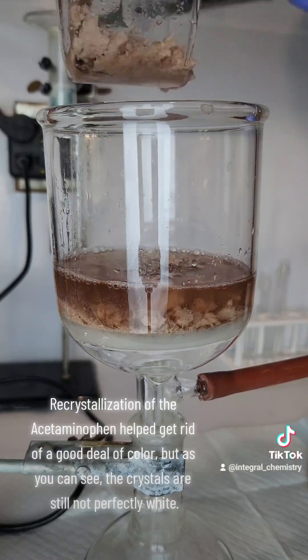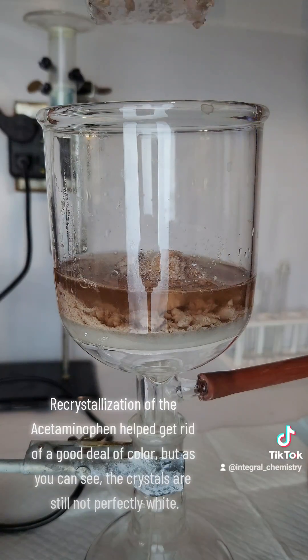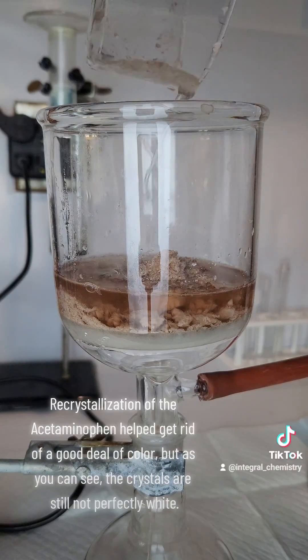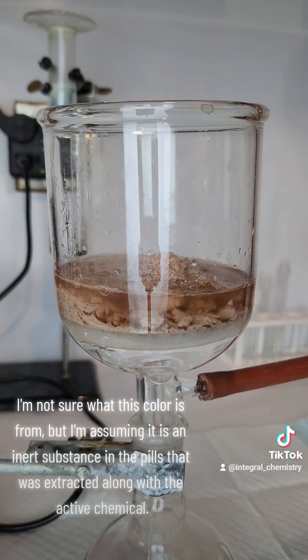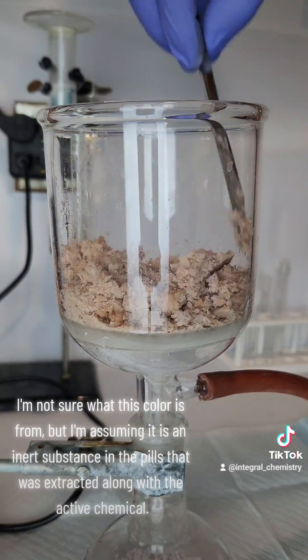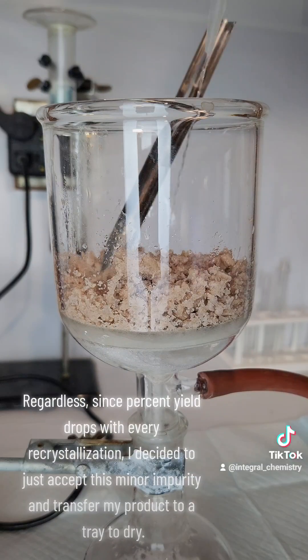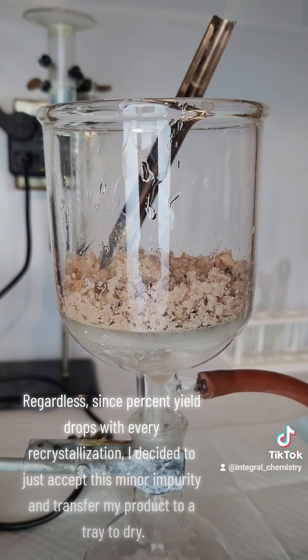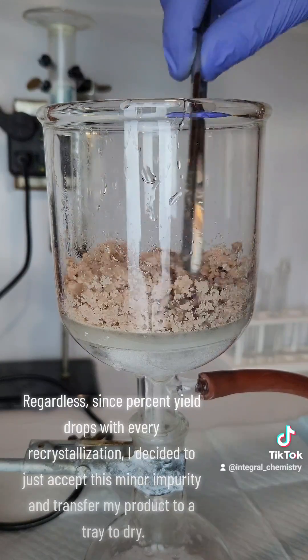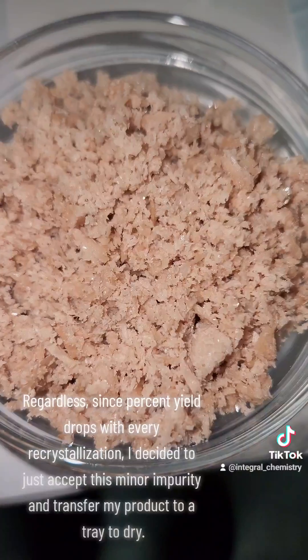Recrystallization of the acetaminophen helped get rid of a good deal of color, but as you can see, the crystals are still not perfectly white. I'm not sure what this color is from, but I'm assuming it is an inert substance in the pills that was extracted along with the active chemical. Since percent yield drops with every recrystallization, I decided to just accept this minor impurity and transfer my product to a tray to dry.